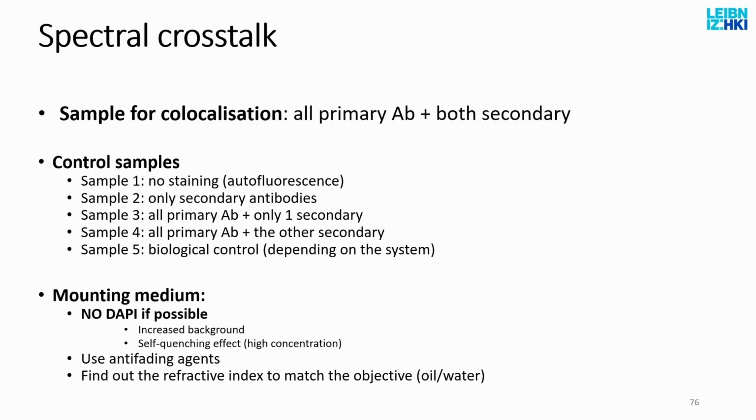If I put oil, the deeper I focus into the water, the more the aberrations. The signal will get gradually worse as I focus deeper and deeper, because now I go through a certain amount of water, in contrast to the oil, which of course helped in the beginning. When I go from lens to oil to glass cover slip, that's the same refractive index.